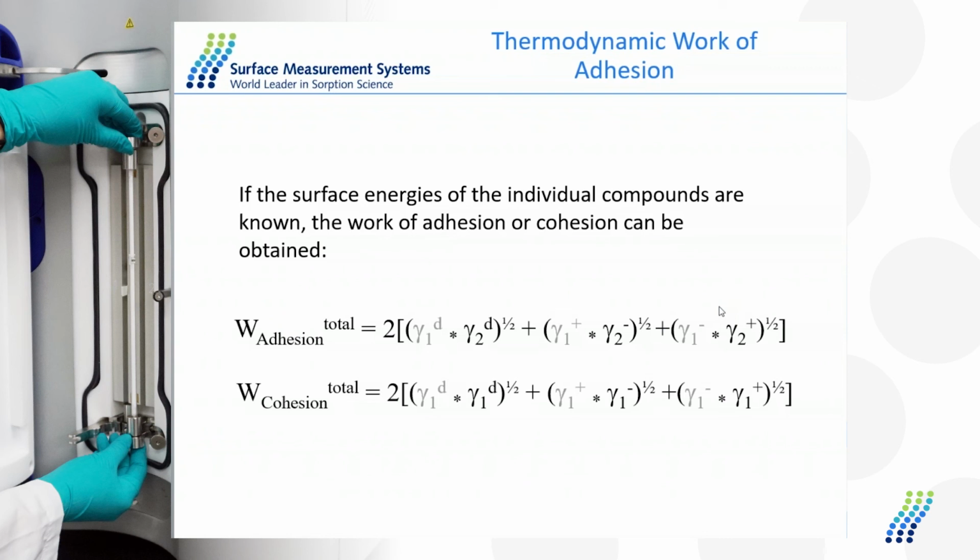Someone else asks, is there a retrofit for older IGC systems? By older IGC systems, the systems that were based off of the 6890 Agilent platform, there's no way to upgrade those to any of our current technology. If it's retrofitting an older, what we call the Inverse GC SEA model, we can upgrade that to different mass flow controllers to work with nitrogen, if that was the question.